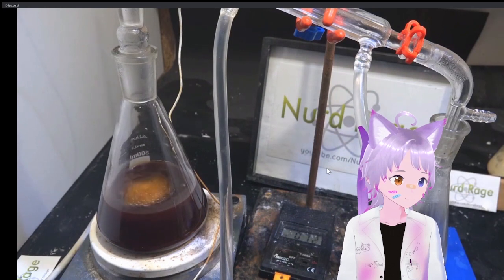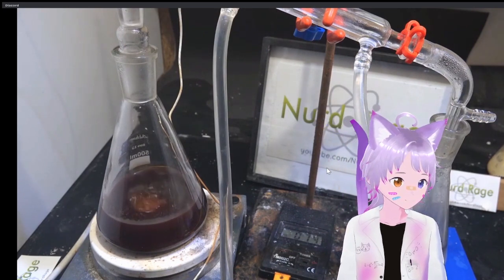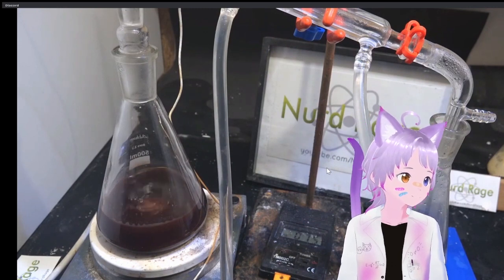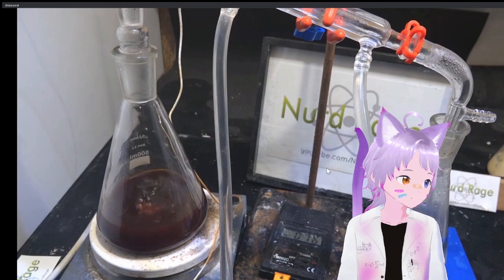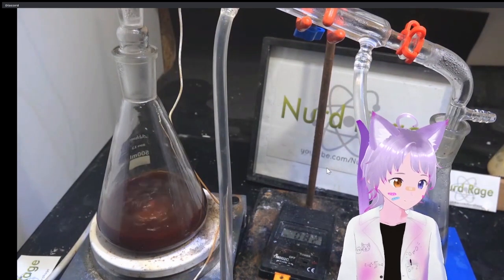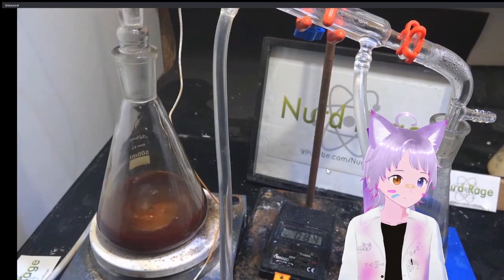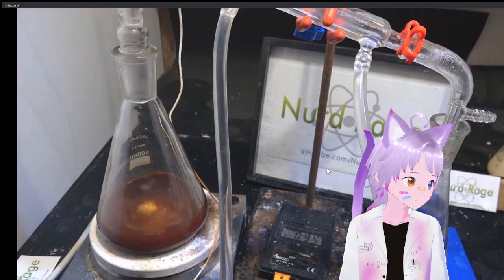I want to essentially remove as much of the organic solvent as I can and replace it with water. I didn't simply boil down dry earlier because I don't know how sensitive pyrimethamine is to heat. If I boil dry, I could destroy the pyrimethamine. Adding in water first means we can remove the solvents and still remain below the boiling point of water. Keep boiling until the distillate temperature goes past 90 Celsius. At this temperature, most of the methanol will have boiled off, and conveniently, toluene and dioxane will also boil off since they form azeotropes with water below this temperature.